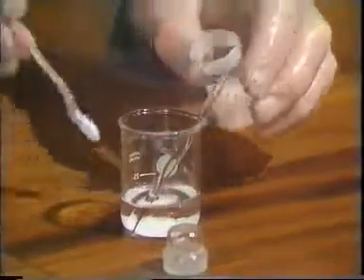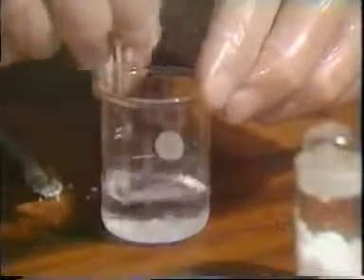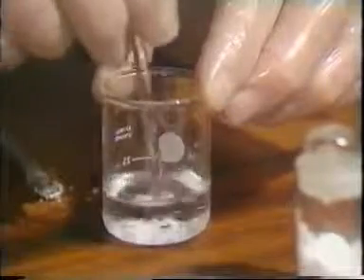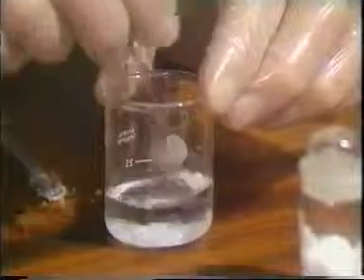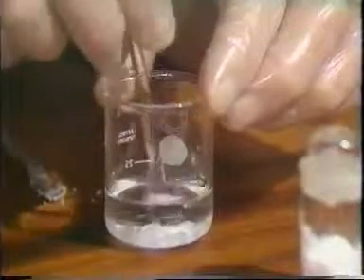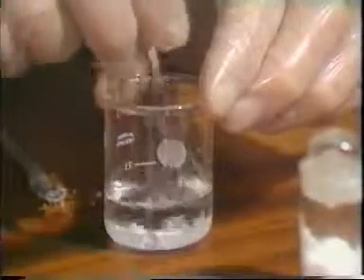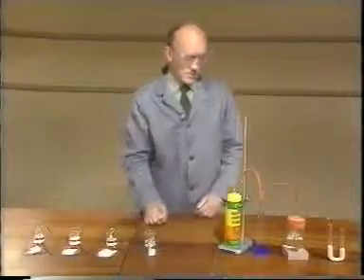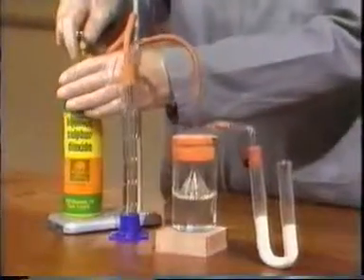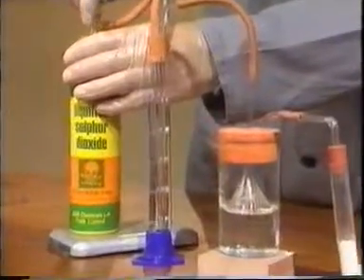No sign of any reaction this time, but when we stir this, it looks as though perhaps some of it has dissolved. Now let's try the sulfur dioxide. I've got the same apparatus here as before, except that the measuring cylinder contains hexane rather than water.